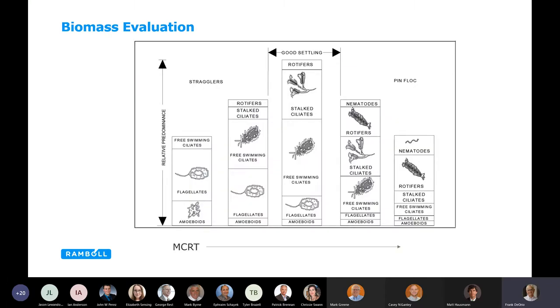As you increase your cell residence time, you get a different relative predominance of certain organisms. They all represent the ability to settle and separate solids from liquids in your final settling tanks. You can see that at early residence times you don't have quite as well-developed flock as you do around five to seven days. And then as it goes longer, you start breaking down again.